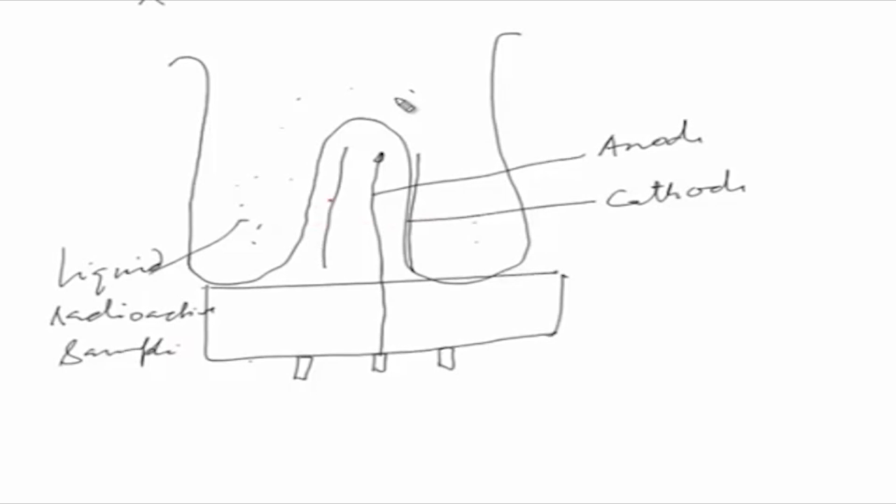So, many times these weak beta particles have to cross the glass chamber here, which might be a problem. So, in both of them, weak beta particles cannot enter the chamber. So, many times windowless counters, where the end window is not placed, could be utilized.